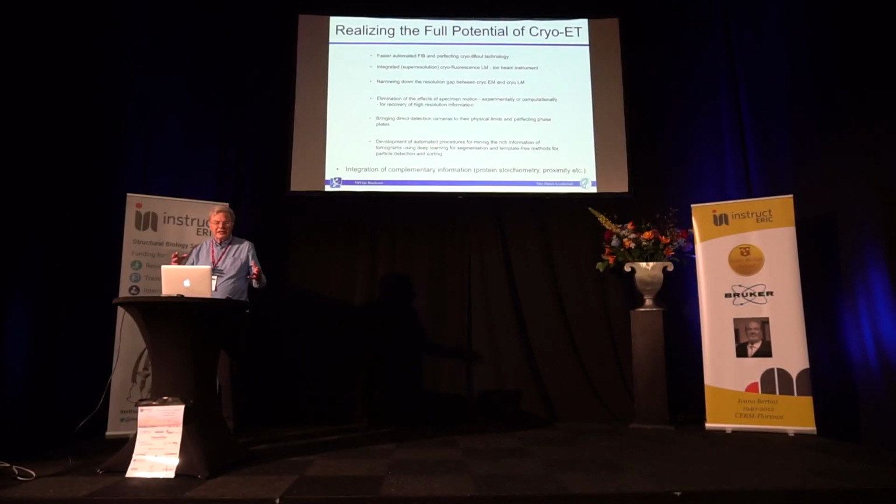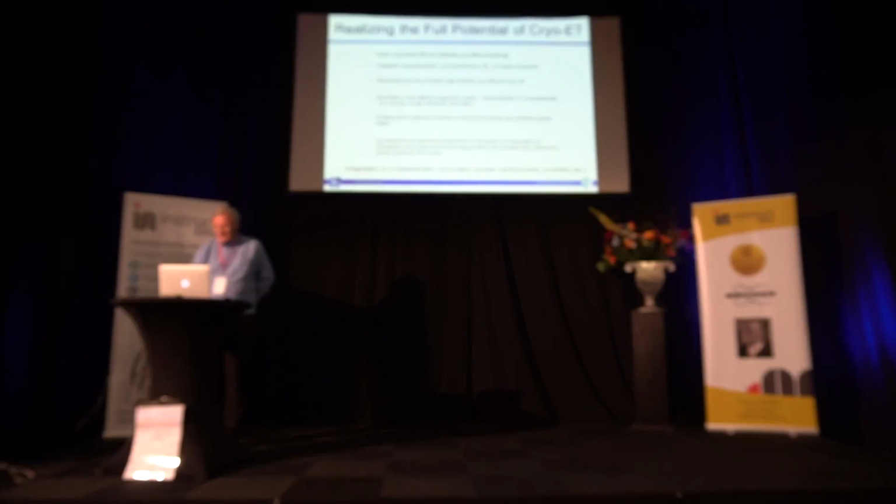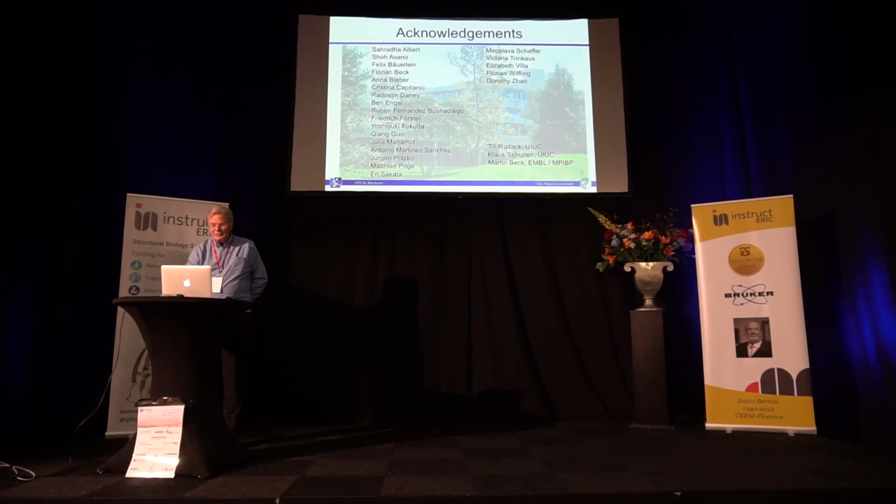The idea is that we can map the large complexes fairly easily, but the small ones will take quite a while and quite some improvements will be needed. But if we have proximity information coming from in situ or in vivo cross-linking mass spec, I think we can model the environment of these anchor proteins.